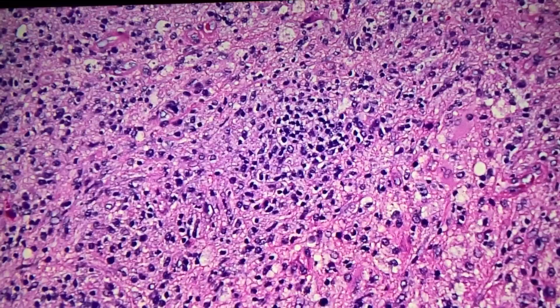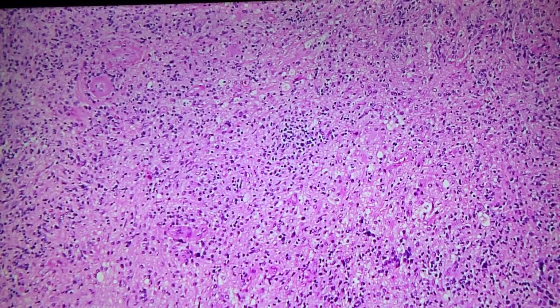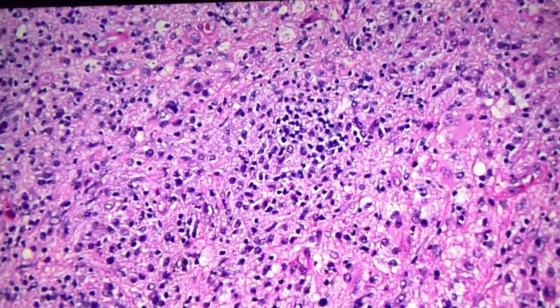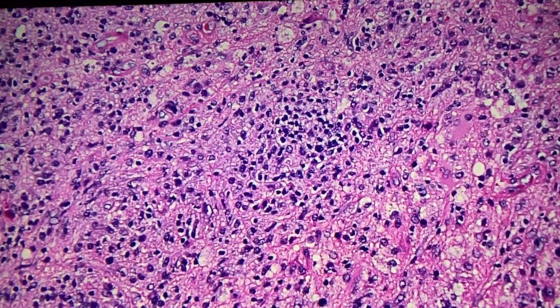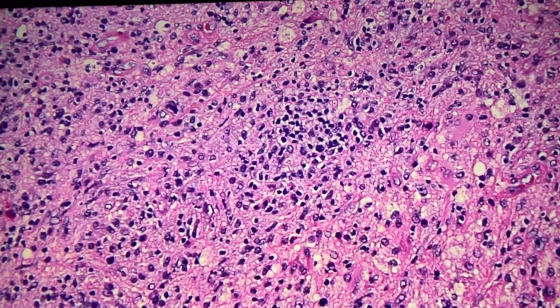Alright. Okay. So can we go one lower? Is the condenser not right? Its condenser's not right. Yeah. Can you flip it? That's about the best I can get it. Let's see. So this, and then for the condenser, I can make it like this. Slightly better. Okay.